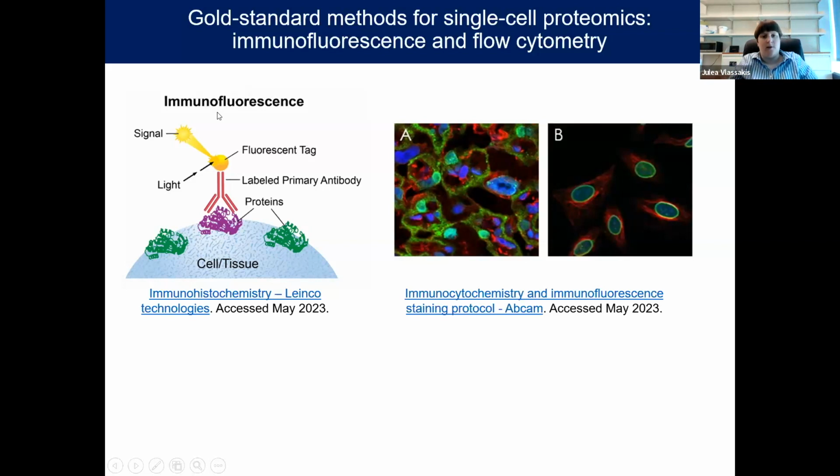Generally, these are referred to as immunofluorescence assays, immunocytochemistry when dealing with cells, or immunohistochemistry when dealing with tissues. These types of measurements result in these beautiful images that you're likely familiar with, for which there are increasingly great tools, such as CellProfiler or ilastik, for retrieving quantitative parameters.